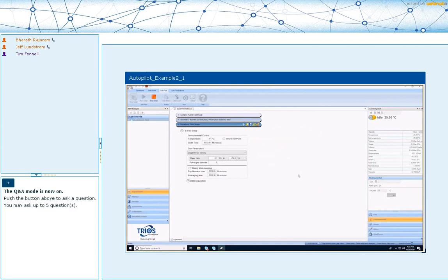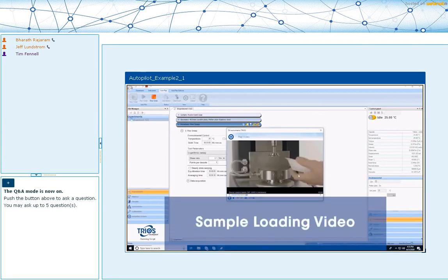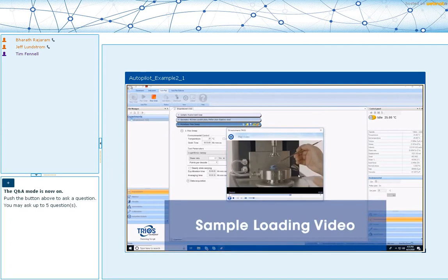Opening and exporting a batch of data files to other formats, including Excel, text, or just like the example we saw, performing the same set of analysis on a set of files.